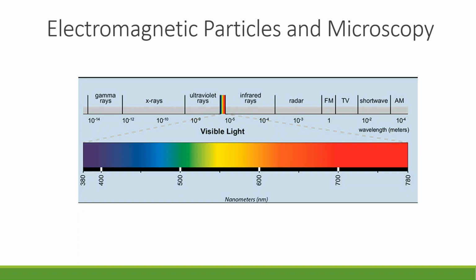This is a limitation of light microscopy. Resolution will be no better than the visible light spectrum allows, down to about 380 nanometers, or 0.38 micrometers, where our vision ends. And you can see that in the image above.